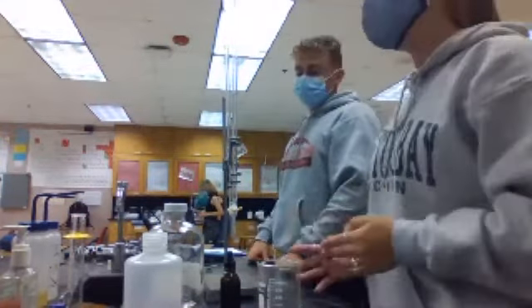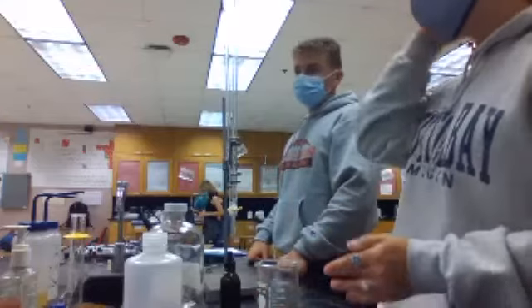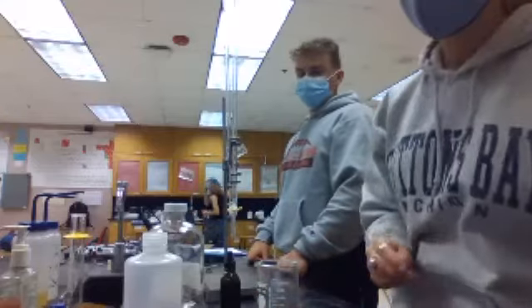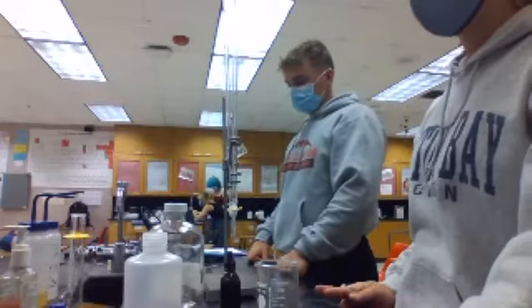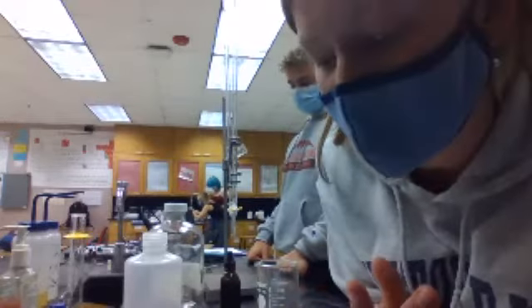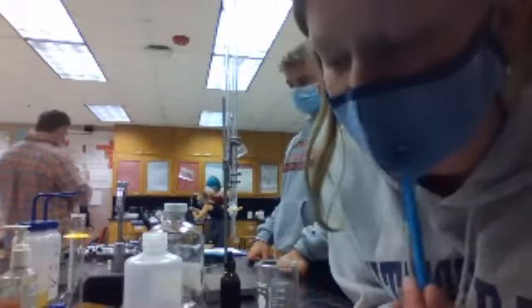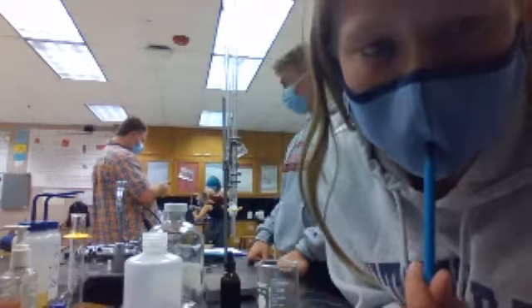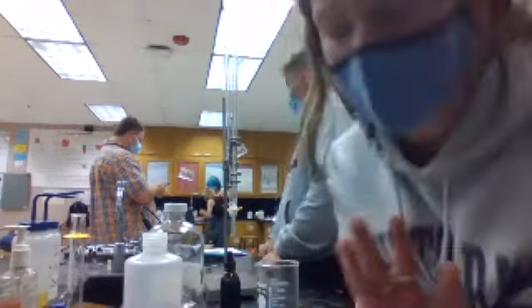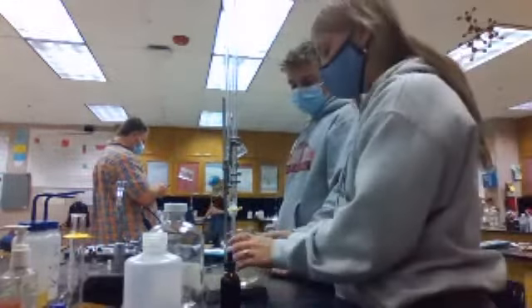But then we didn't find the pH of this yet. It should be the same as 0. The indicator shouldn't change it. Oh, okay. So it's still the pH of 0 milliliters. The pH is 0.96, what we found earlier. Okay, so 1 milliliter. Yes, thank you. You're welcome.